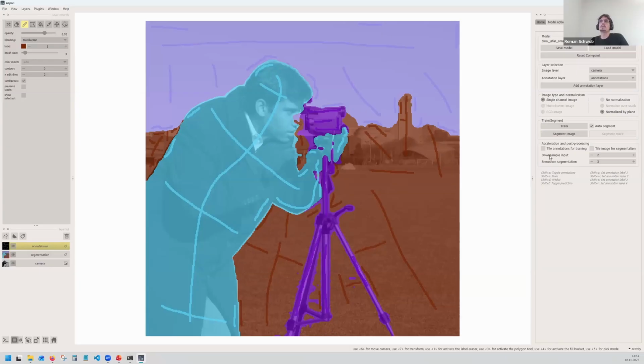So I would really recommend, if you're planning to use Convpaint, really try to play around a little bit and try those settings here. That's also why we put those in the home tab, the main tab, because depending on what resolution your image has, you really don't need the original resolution, because it's only going to use up your computation, basically.